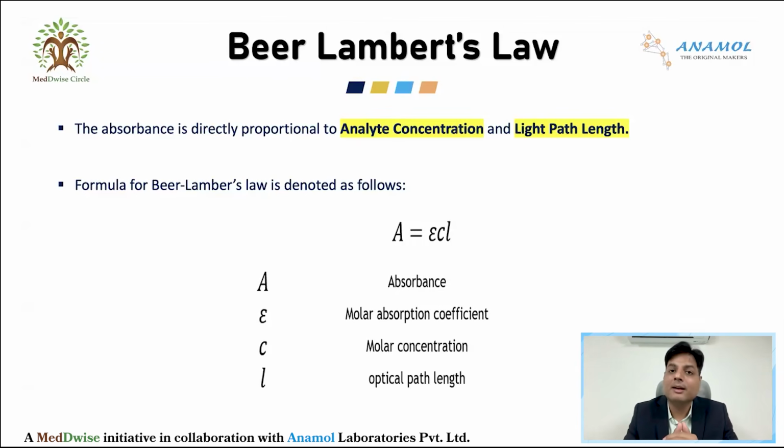Now, friends, tell me, if I directly add the patient sample in the glucose solution and the color is formed, and when I pass the light through this colored solution, will I come to know about the concentration of glucose in the patient sample? The answer is no.